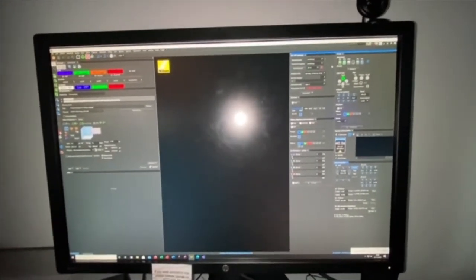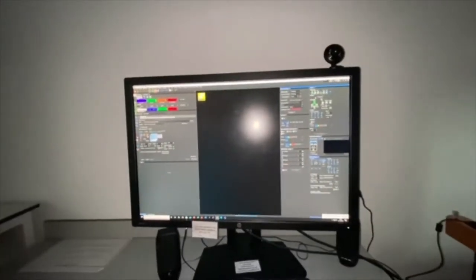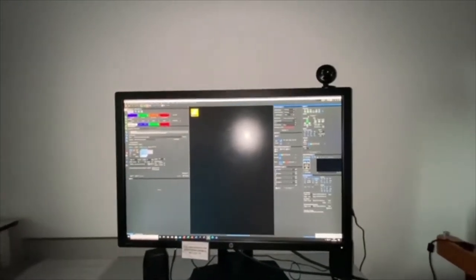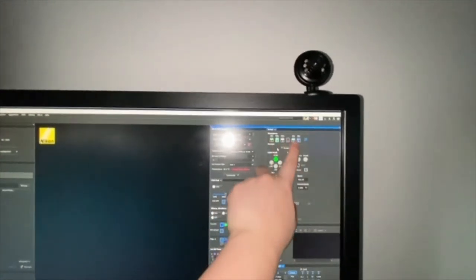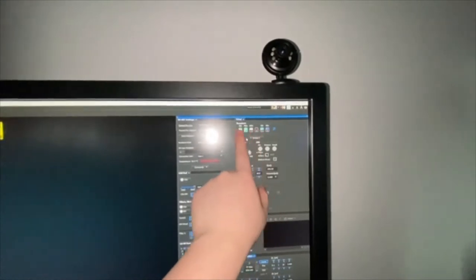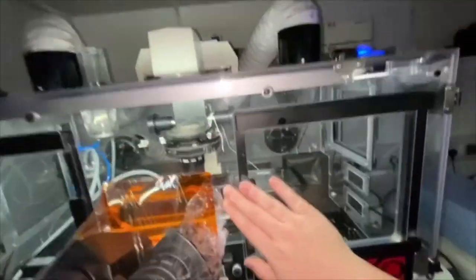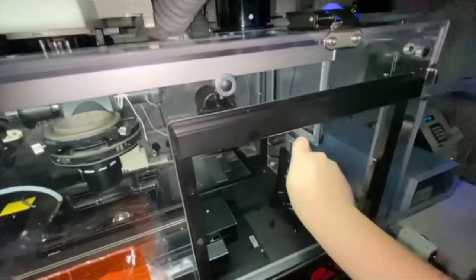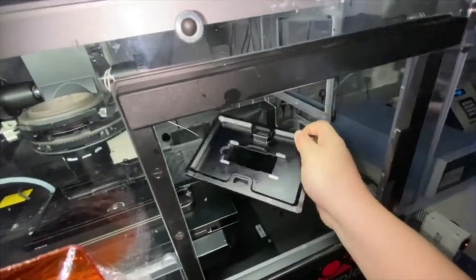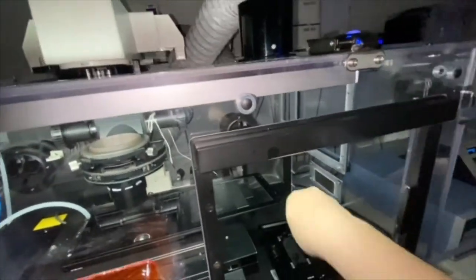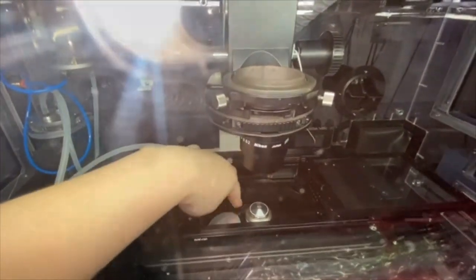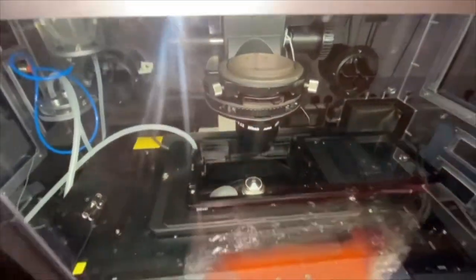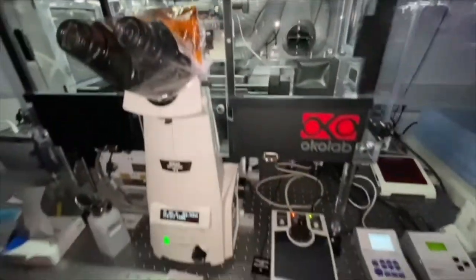The most important rule on this system is that before you switch between lenses — these are all the lenses on this machine — and before you insert your slide holder, you need to lower the lens stage all the way to the bottom. All our lenses are on a rotation stage, so you need to lower that all the way to the bottom.